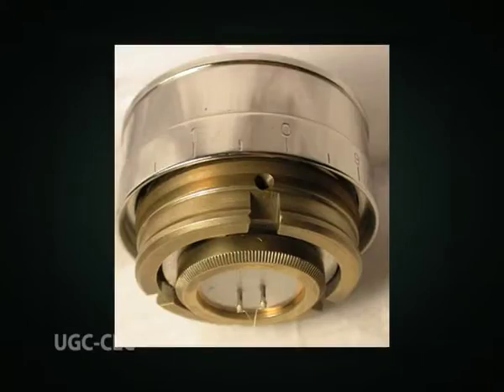An electron gun at the top of the microscope column and a system of electromagnetic lenses focuses the electron beam on the sample. The interaction of electrons with the material, that is electron scattering, results in the image contrast in TEM. The image resolution is directly proportional to the acceleration voltage of the electrons.